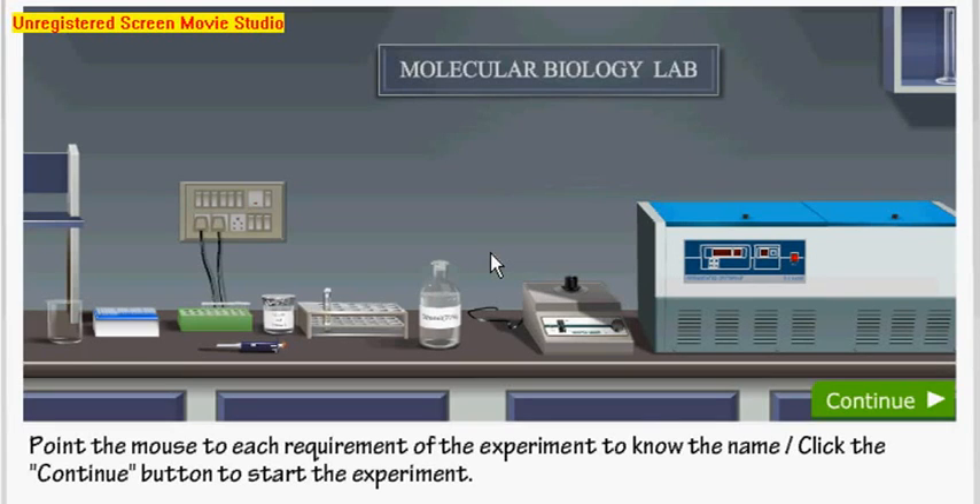Now we will talk about the plasmid isolation system. Here are the ingredients required: a beaker, micropipette tips, micropipettes, vials to store the samples, Eppendorf tubes, TE buffer with RNase A solution to degrade RNA, bacterial culture to isolate the plasmid from, 70% pure ethanol, a vortex mixer, and a centrifuge — either macro or micro.